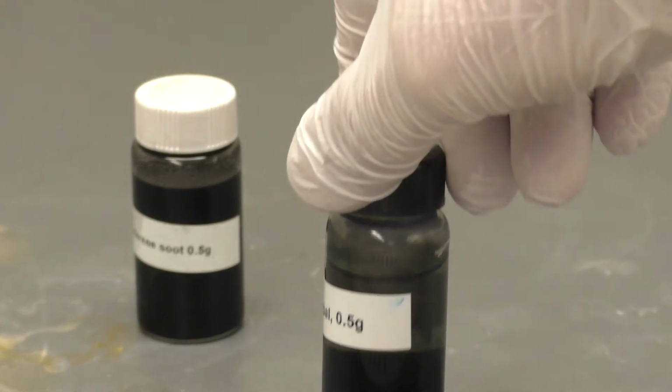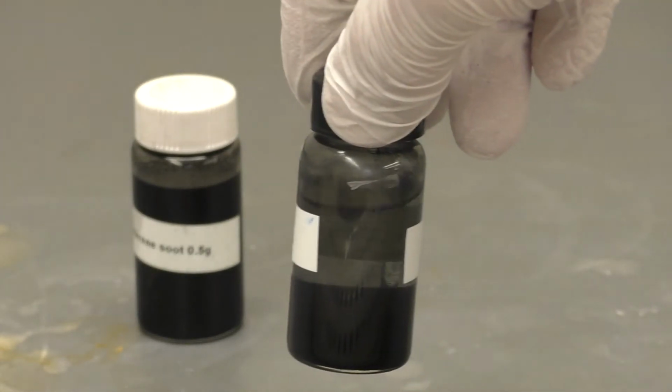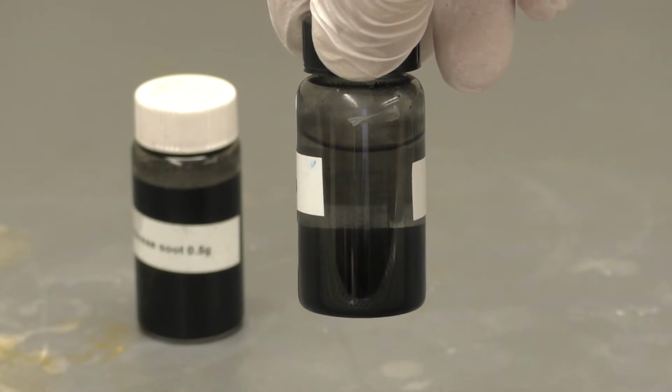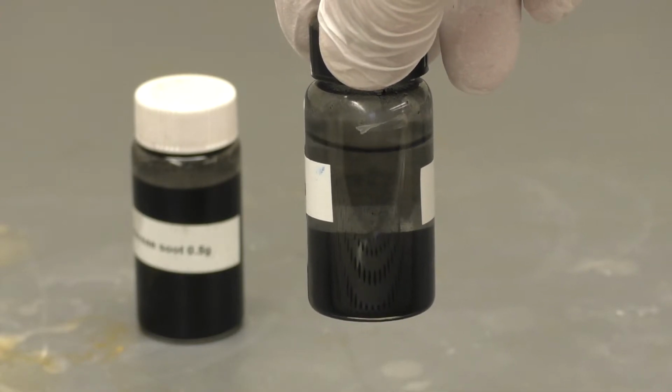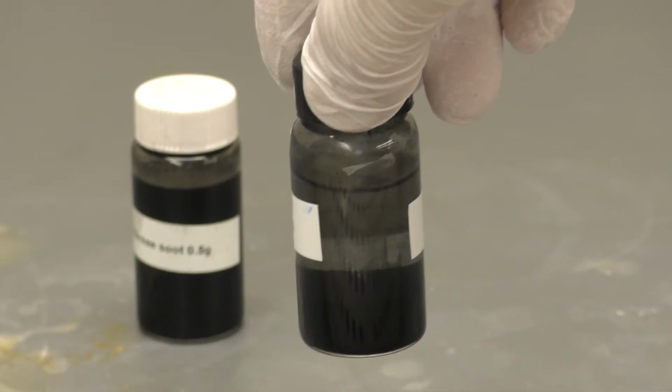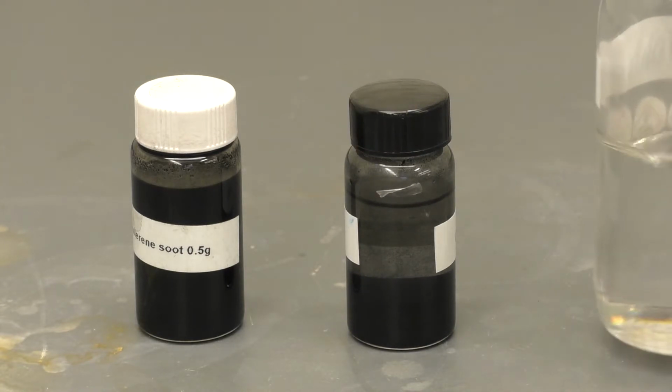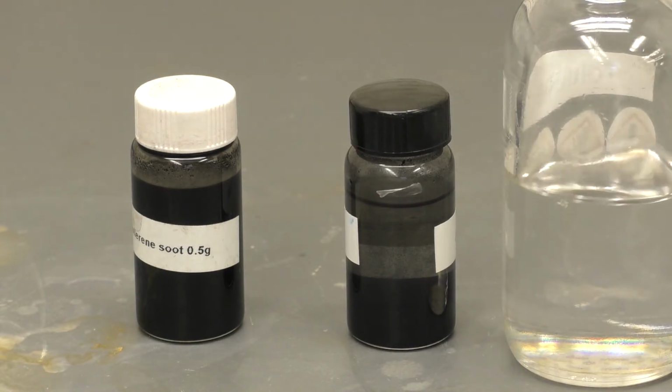So you can see that the tag's in the way. I'll turn it around. So do you see the soot that has fallen to the bottom and the toluene is just sitting there on top? We don't notice anything different. The toluene layer on the top still looks colorless like the original toluene did.